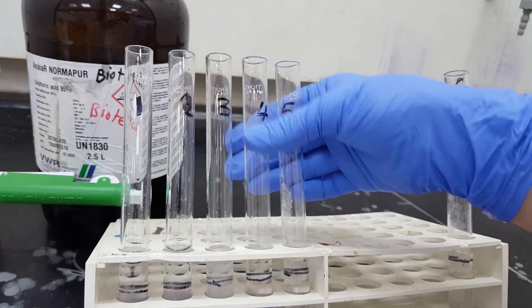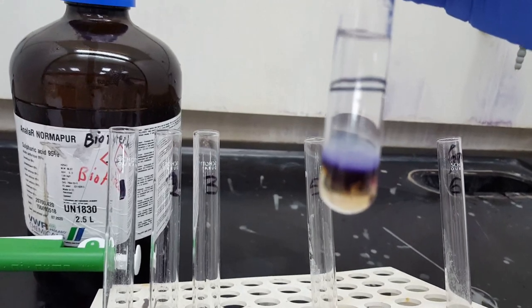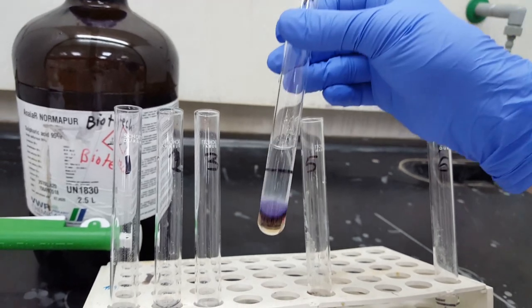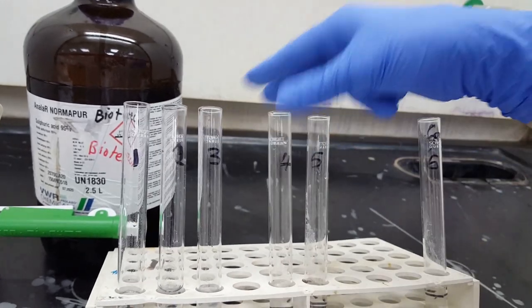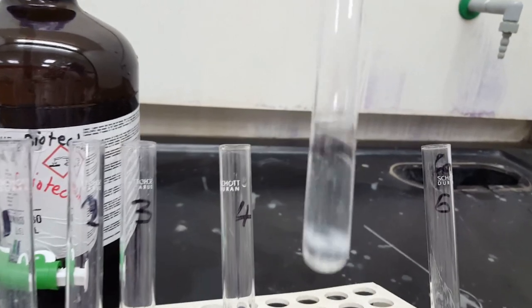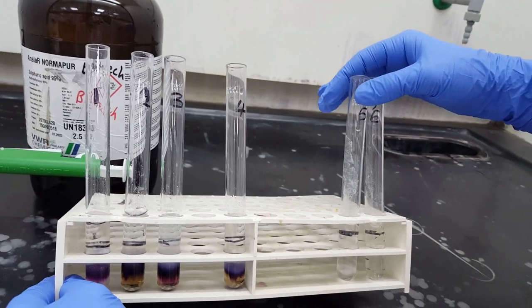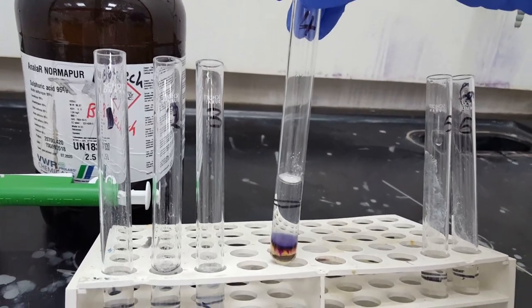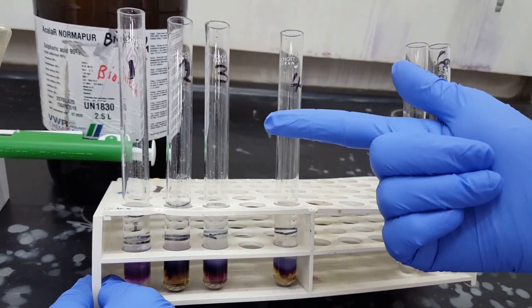What about unknown one and unknown two? In unknown one, we can see the purple ring, and this purple ring indicates that we have carbohydrates here. But what type of carbohydrate? Is it mono, di, or polysaccharide? We need to find out. What about test tube number 5, which has unknown two? We can't see anything here. There is no purple ring, so we can now exclude unknown two from our test. Then we have to proceed with unknown one, to find out whether it's a polysaccharide, a disaccharide, or a monosaccharide.